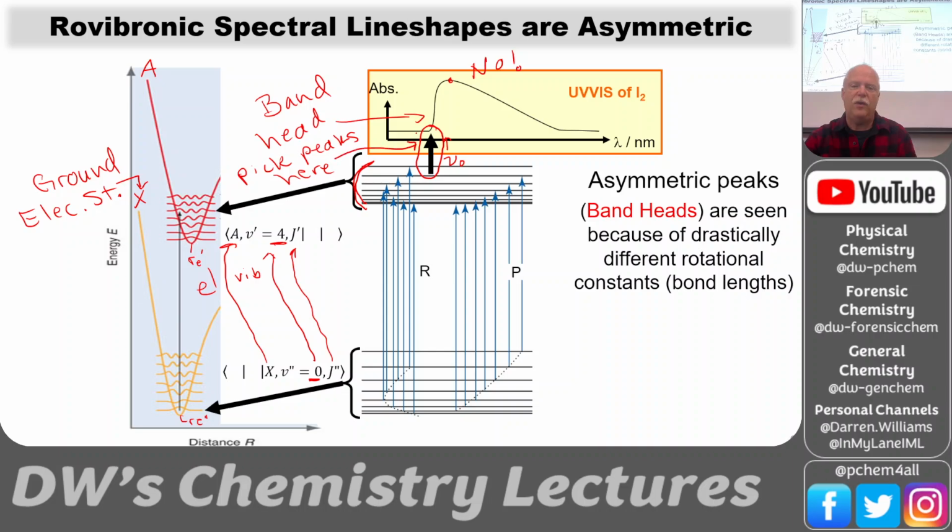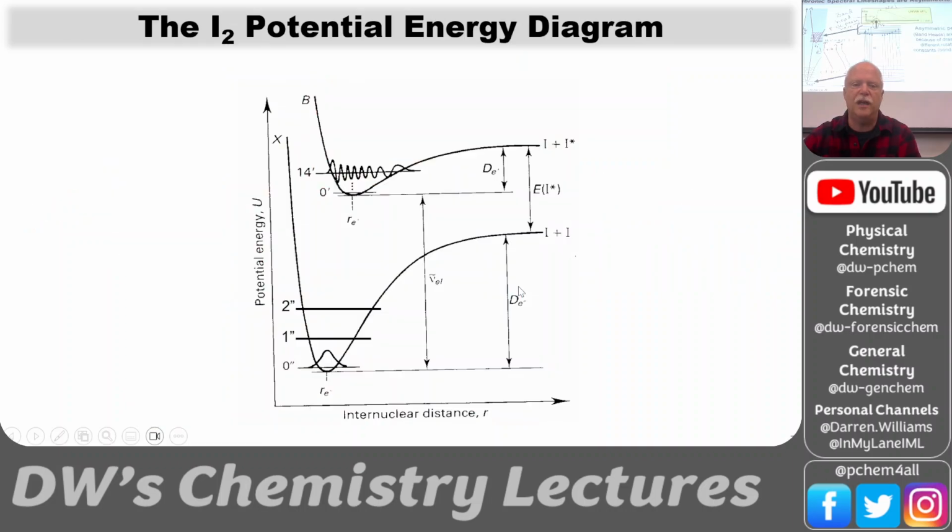Now, why would we do that? Well, because they've done this experiment multiple times, but 2 ways. Picking the peak maximum gave good results, but picking the minimum on the short wavelength side gave better results. And it was because that band head was more consistently close to nu 0 than the maximum. So that's the justification for picking the minimum on the short wavelength side.